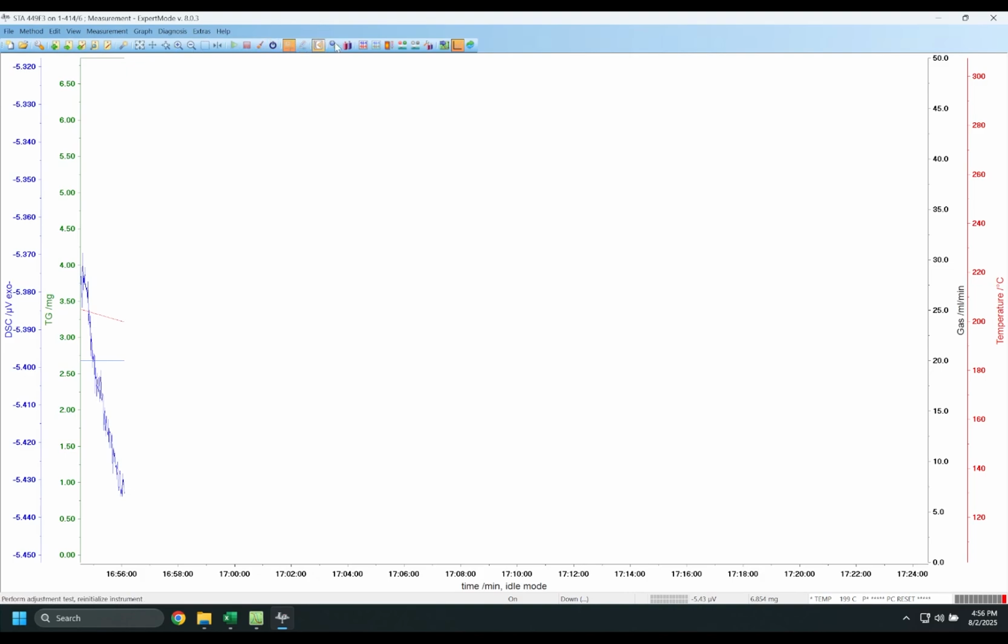You'll have a toolbar below that with some commonly selected functions, and then you'll have your main graph view, which currently will be showing the idle statistics of the instrument, but will also show you the live data during your experiment once you start running it.